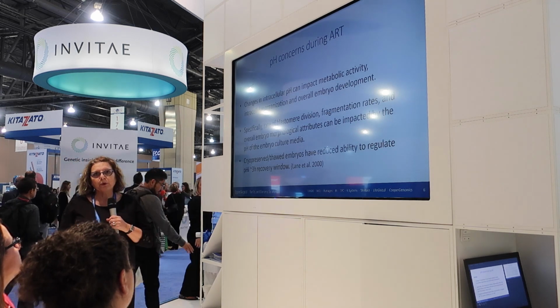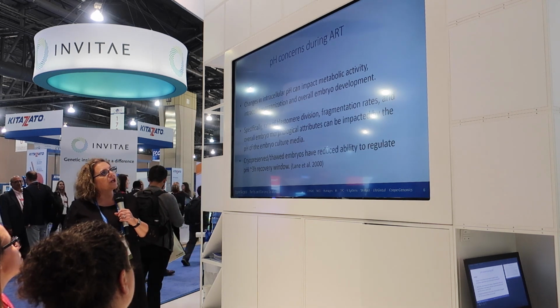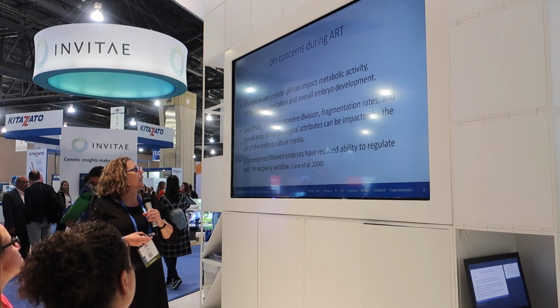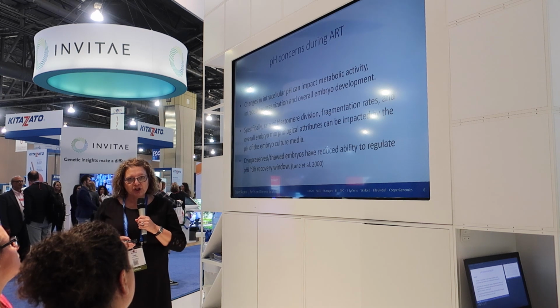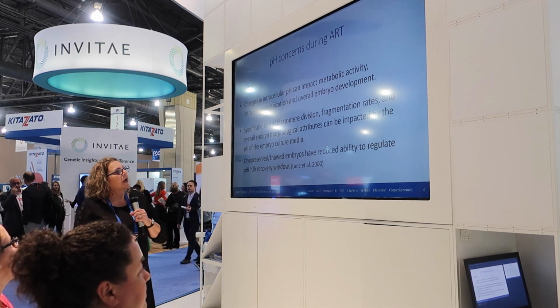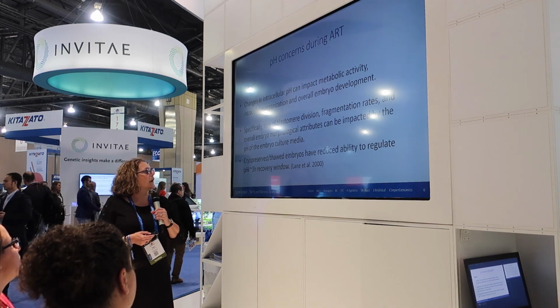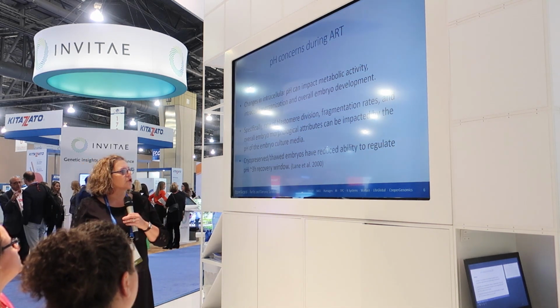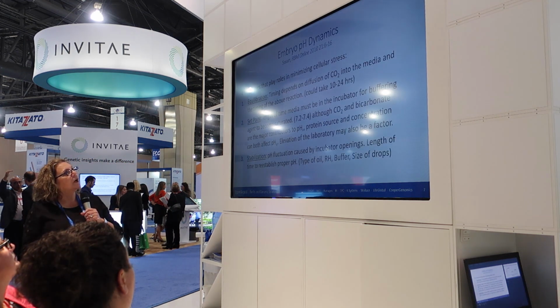Is it important in embryos? It is also important with embryos. Changes in intracellular pH can impact metabolic activities, intracellular organization, and embryo development. It also impacts blastomere division and fragmentation rate. So if you're getting a lot of embryos with fragments, you may want to look at pH, and just overall, your embryo morphology. The other thing to remember is that cryopreserved and thawed embryos also do not have a very good balance in checking pH. So there are really three phases of pH dynamics.